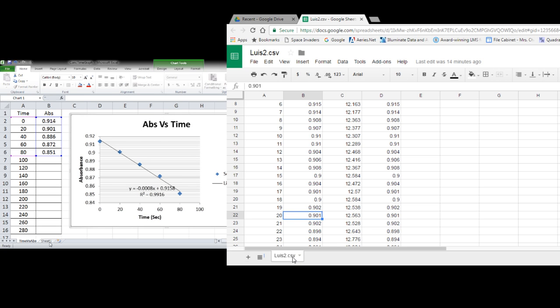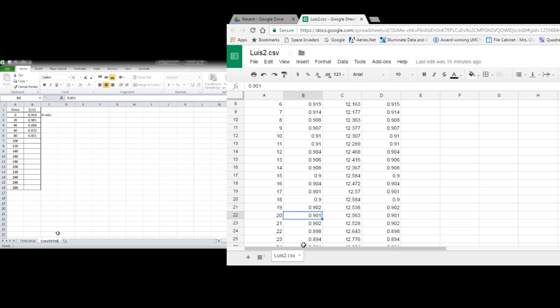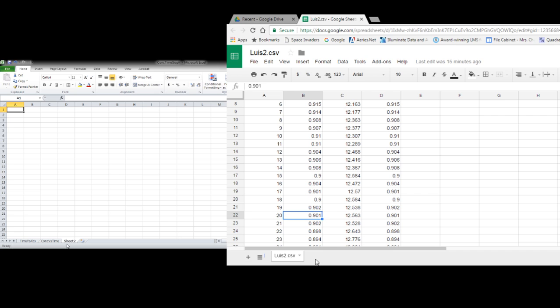So we've got that. And then, you know, again, if you want to change the name on these, you can put, you know, concentration of CV. And then if you want to make another one which you'll need to do, we can call that the natural log of concentration versus time.